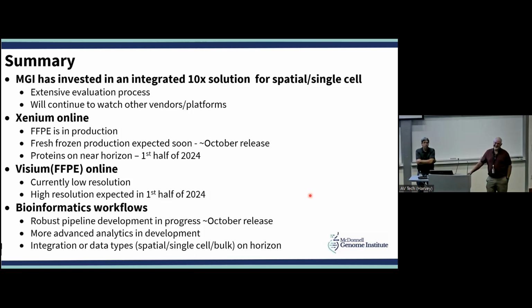Taking it into the Xenium process, you diminish the signal a lot. In other words, you're putting this one code onto the RNA. I guess the code is turned off, and then it would go into the Visium, and the RNA is unaffected by this whole journey. We haven't tested it ourselves. That's what we've been told by the manufacturer, that you can go from one to the other and there's no degradation of signal, or at least nothing significant. You could do an experiment like that for sure, to make sure.